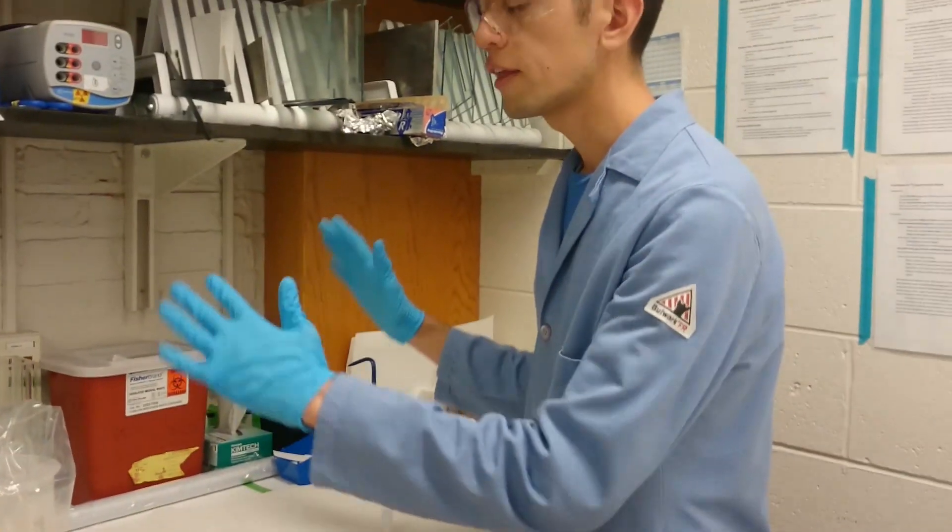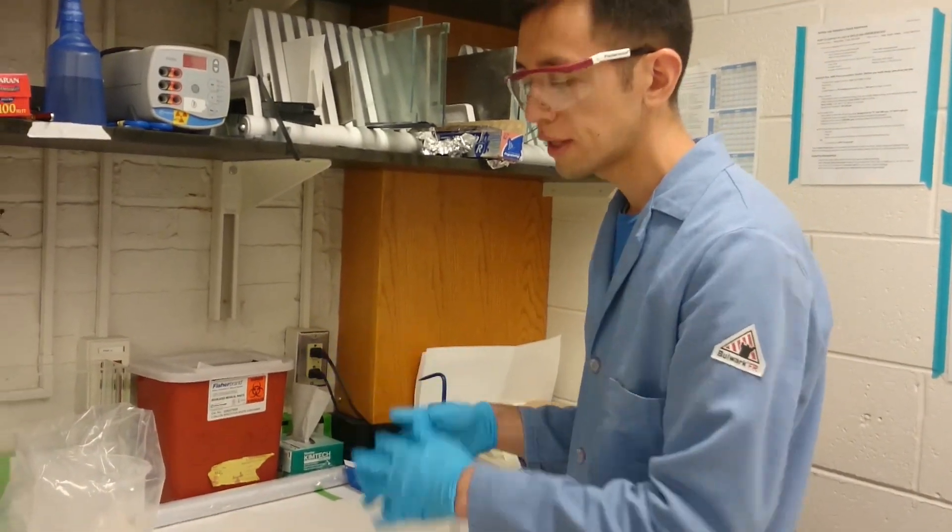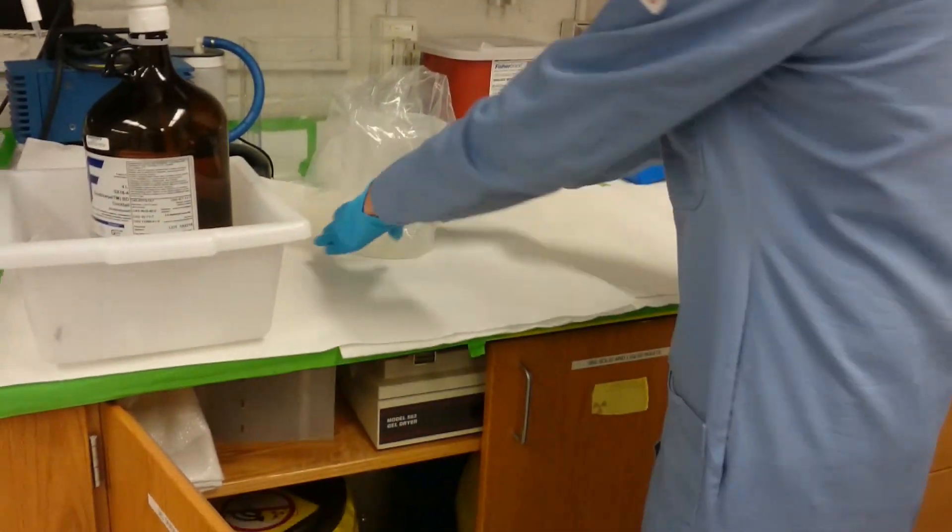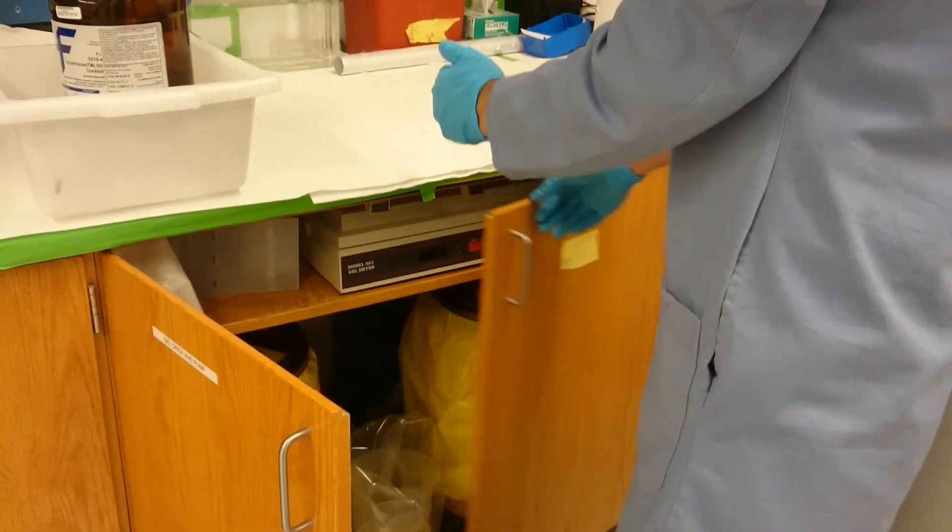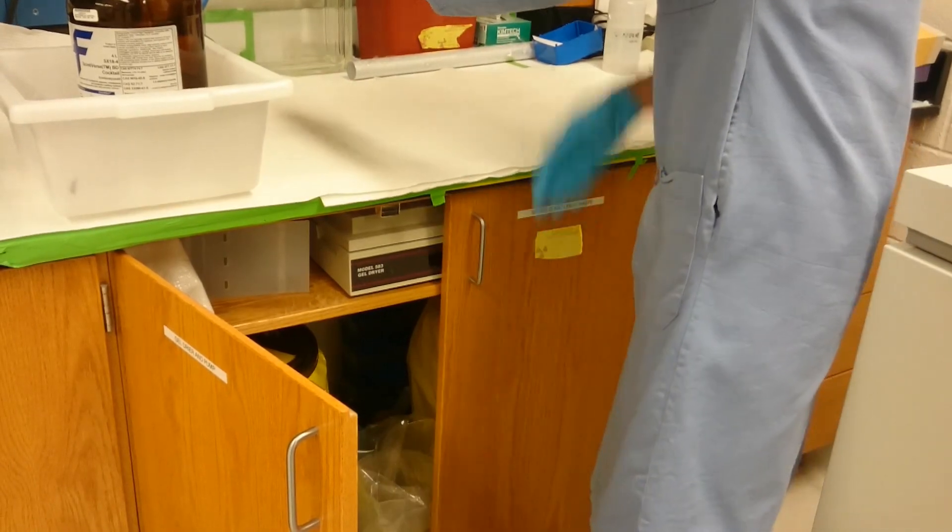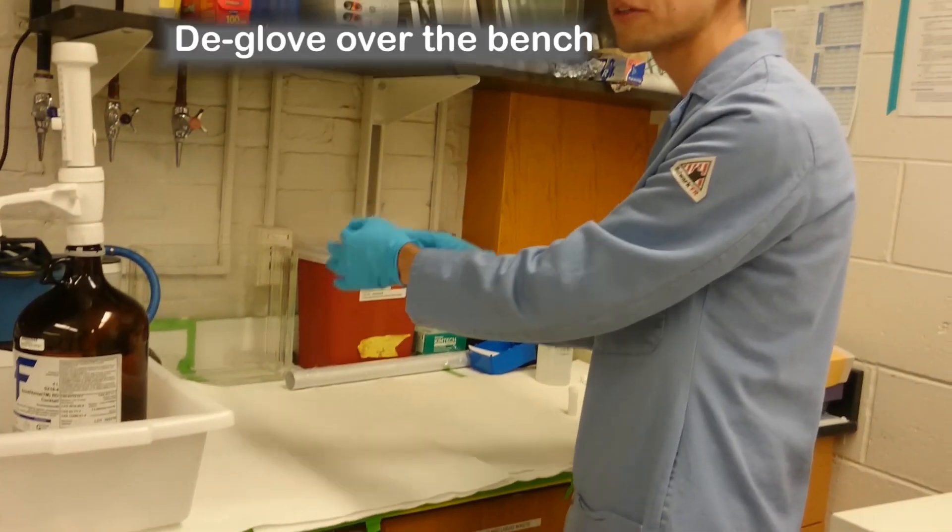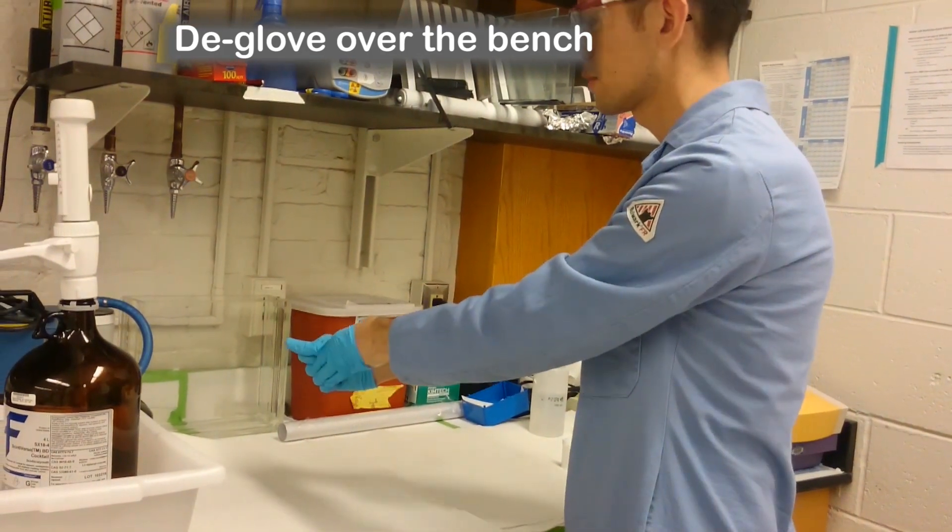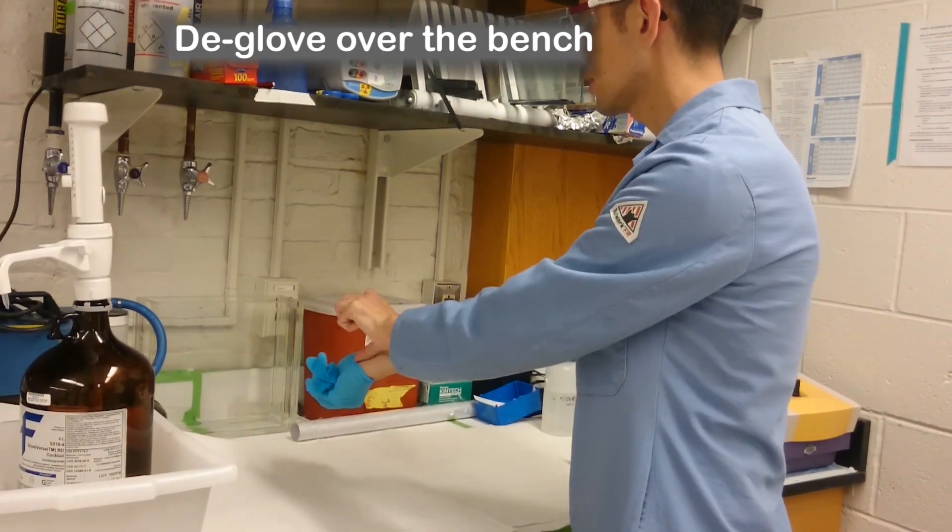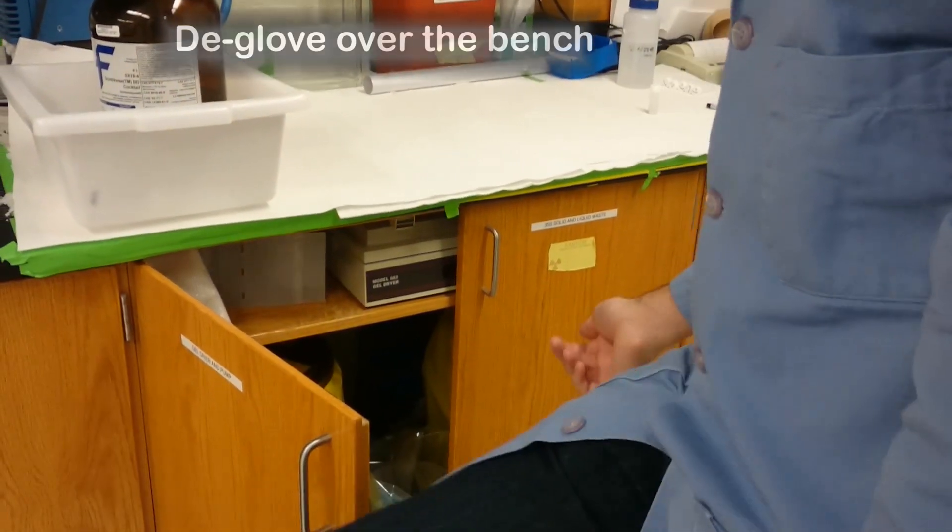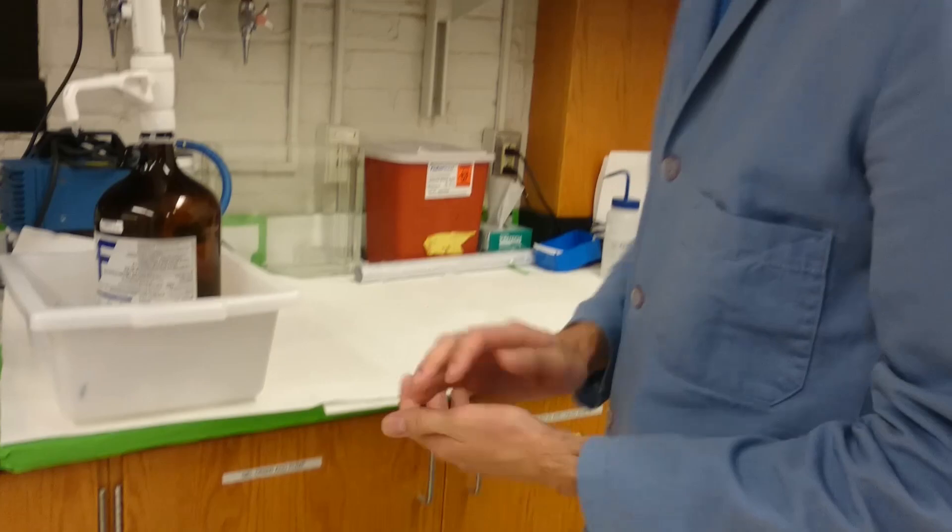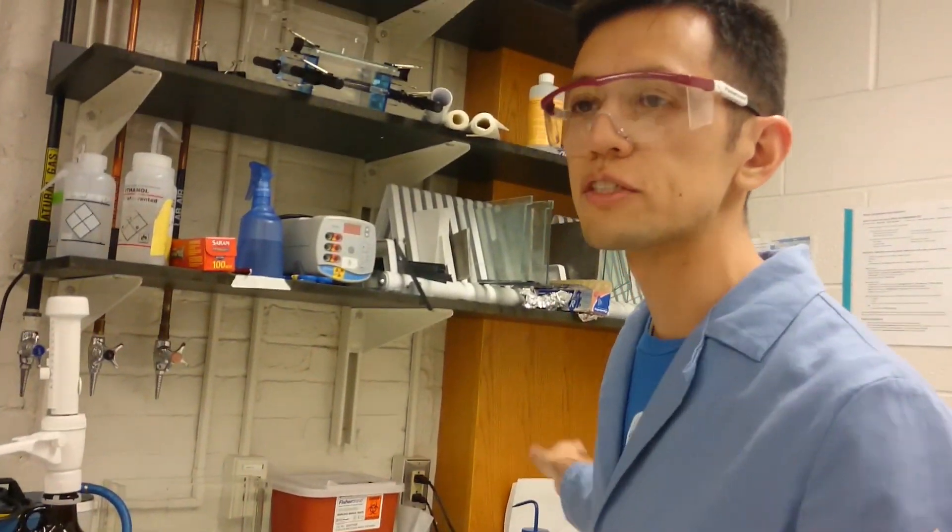When you're completely finished working, you should deglove. Always make sure to deglove over the work area, just in case your gloves were contaminated, and they throw aerosols. You want it to be over the workbench. Deglove by reaching inside, turning it inside out, throw this in the waste container, and close the cabinet. Also make sure to turn off the scintillation counter.